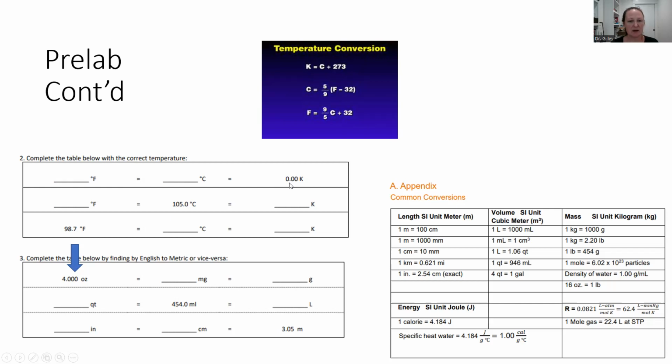So this is 0.00, right? So they did these 0.00s on purpose, right? That's supposed to be letting you know that you should report your answer in 3 significant figures. Whereas 105.0, these two numbers then should be in with 4 significant figures.